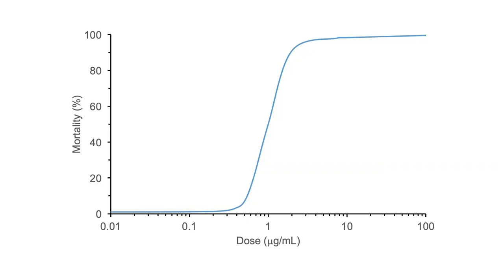A standard dose response to a larval mosquito control agent should look like this. Mortality is plotted on the y-axis, and the logarithm of dose is plotted on the x-axis. Note that there is no mortality of larvae at doses on the left side of the graph. On the right side of the graph, mortality reaches a point at which mortality is 100% as dose increases. Including doses in both of these regions of the dose-response curve in your laboratory bioassay is not informative.